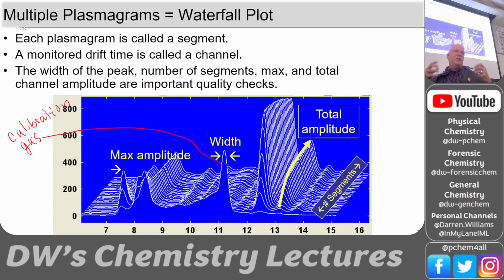It's a gas that's easily charged by that source. And so what happens is your molecule actually comes in and it bumps into the calibration gas that's negatively charged or positively charged, and it either donates or steals an electron from your sample. And so then it's the calibration gas that charges your sample. And then you get this.